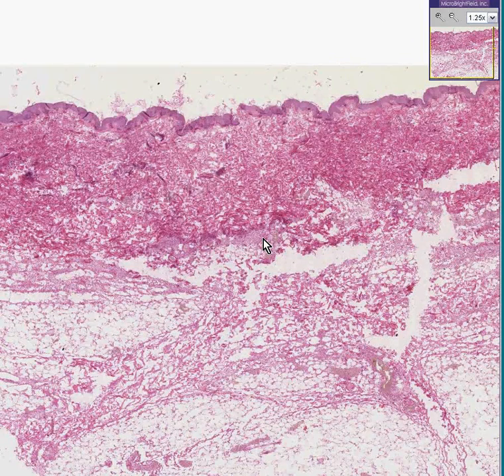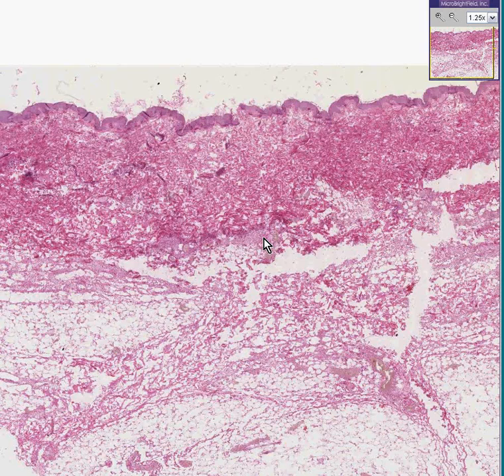This is erysipelas caused by Group A Strep, and I thank you very much.